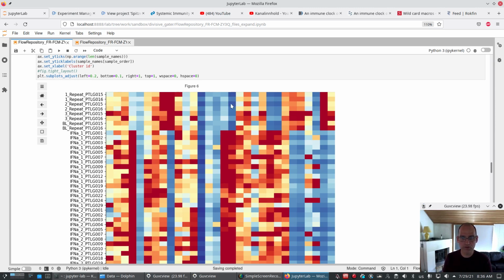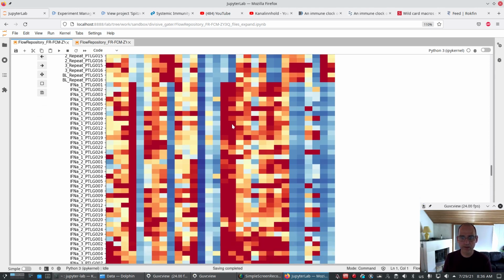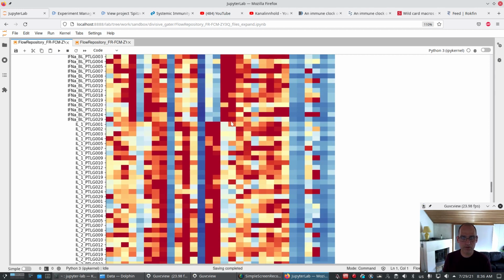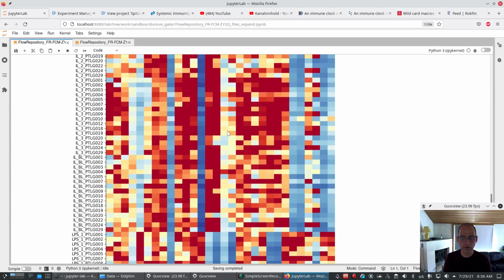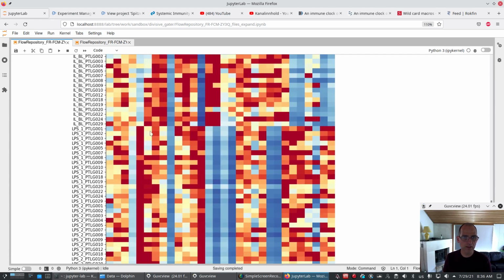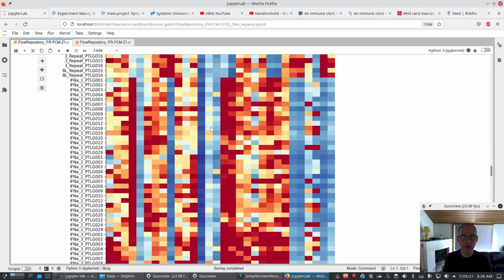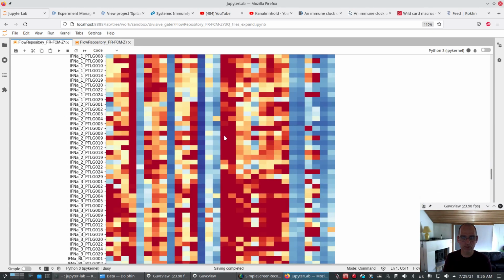I see there is a transition of colors here, so there is something going on with these 2 clusters. Let's go down and see if it transitions again. Yes, it transitions, and that's at another shift of names. Let's keep it. And it transitions again, exactly at a shift of name of stimuli. Was it here? I have forgotten now. Was it this one? Oh no, it was the next one. It was this one.